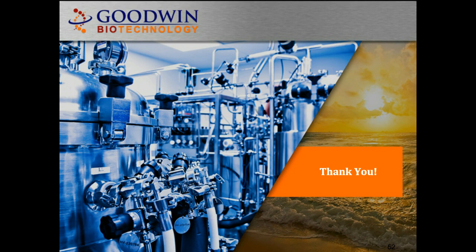First question, Jeff, I think is for you. What is the risk of ETO residual left in plastics? If you have ethylene oxide left in plastics or even glass, it is a carcinogen which could definitely harm the end user. That's why it's critical, if you are doing chemical sterilization, to make sure it's a validated process and that there's repeated validation being done to make sure that the residuals are eliminated.